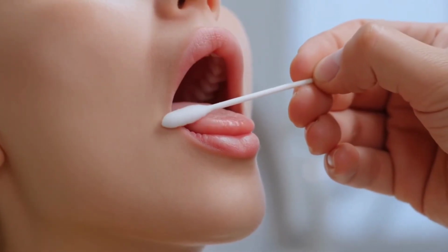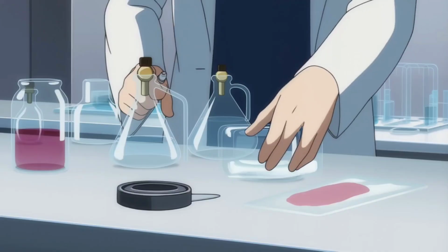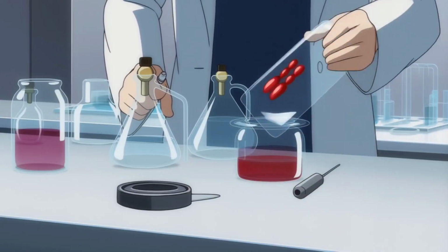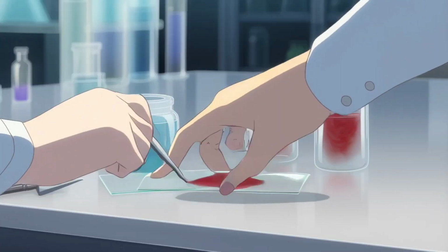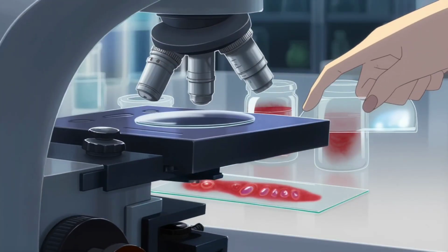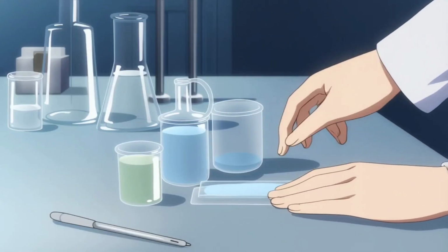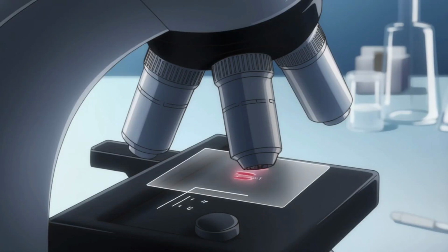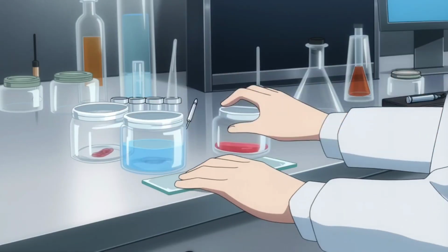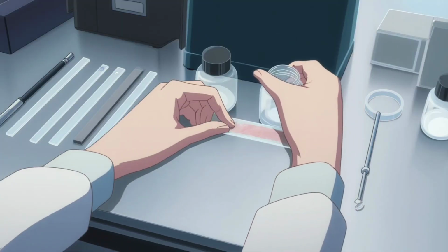Before going to my chart procedure that I have drawn, we'll go to what AI has given me. It has given me some good things as well as bad things, but mostly bad things, and it is not enough to represent the Barr body experiment, but it did show me in animated form as well as a realistic manner. There are two types of AI generated videos that it gave me, but they don't have any voiceovers, and that's why I'm giving the voiceover.